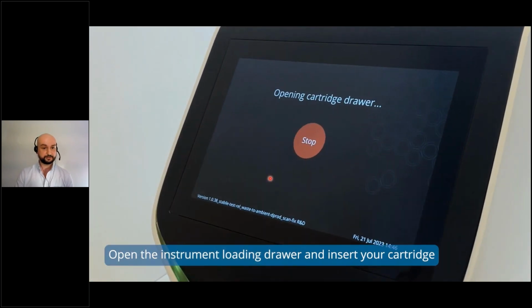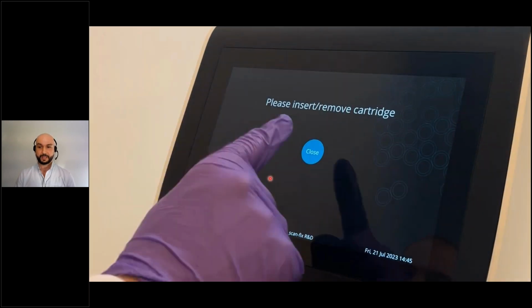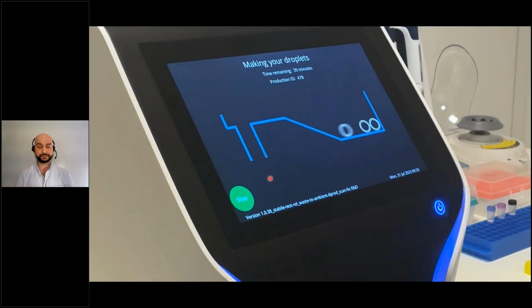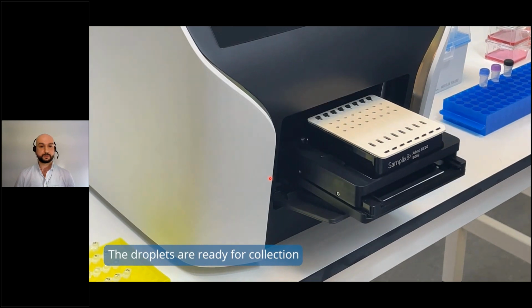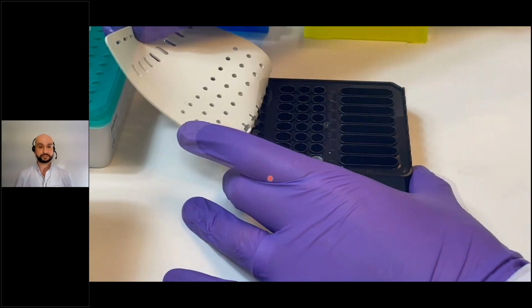Once the reagents are in, the cartridge is sealed and placed into the instrument, the Xdrop. Afterwards, the user can select the program and the lanes to be run, and after up to 40 minutes of droplet production, the cartridge can be taken out, and the droplets are ready to be collected and processed further.